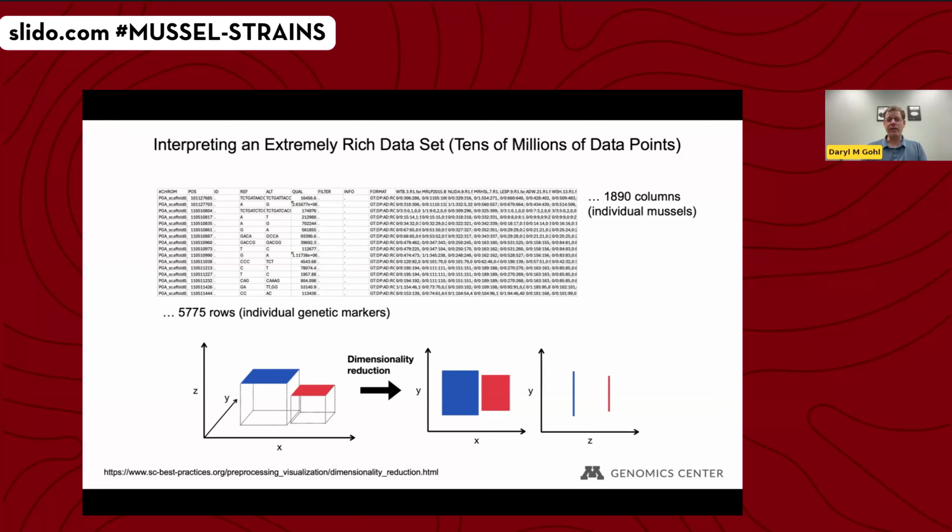And so we use a variety of what are called dimensionality reduction techniques, and these are essentially mathematical algorithms that take something in a higher dimensional space, like these colored squares here that are shown in 3 dimensions, and you can take that information and basically compress it down into a lower dimensional space that you can more easily visualize. And so rather than doing this with 3 dimensions here, we're using a similar kind of mathematical approach to do this with 5,000 plus dimensions, and then compressing it down to 2 or 3 dimensions where we can more easily see what's going on.